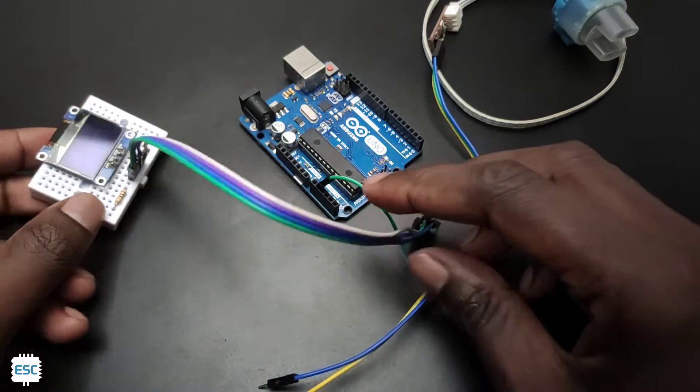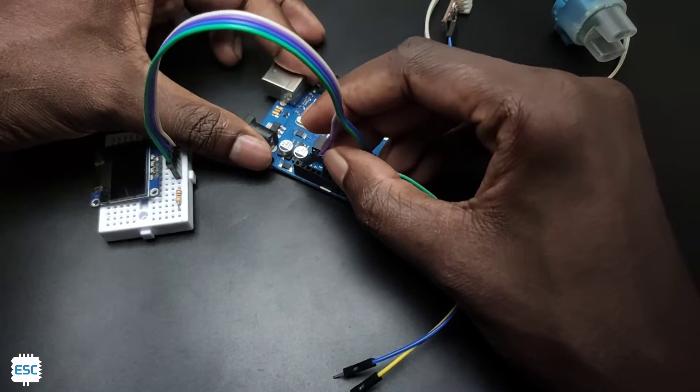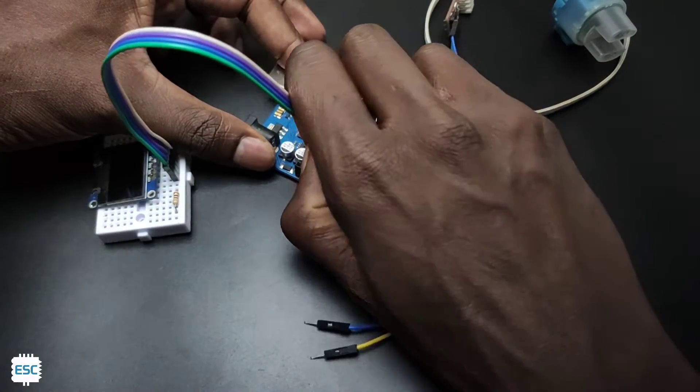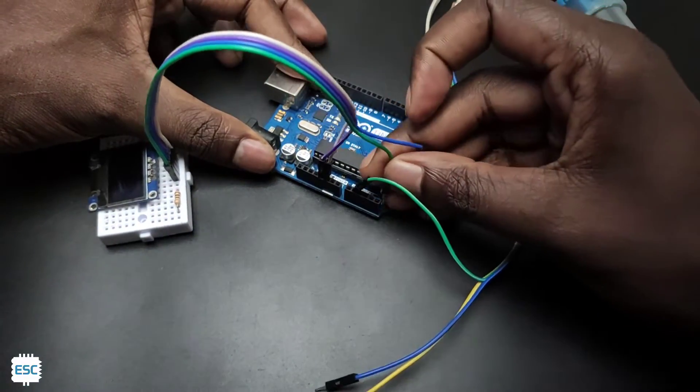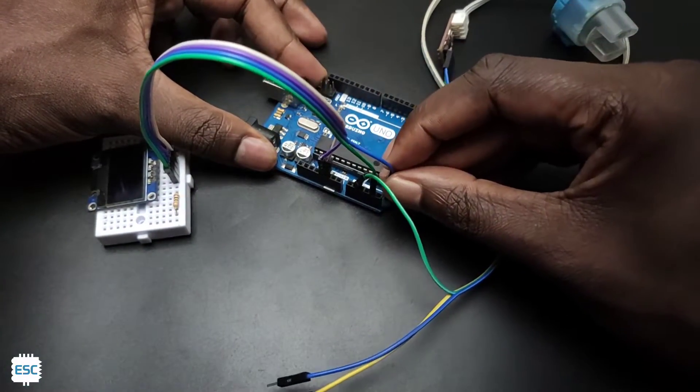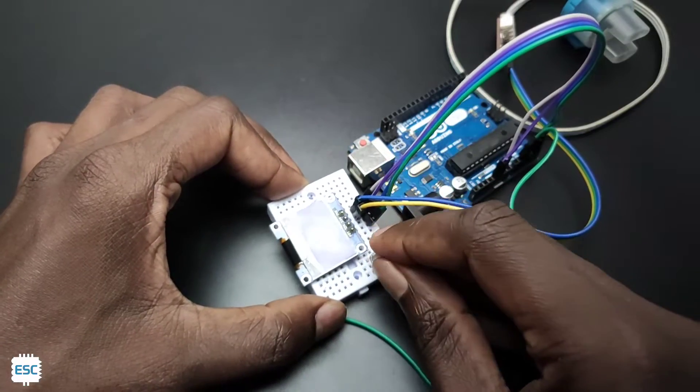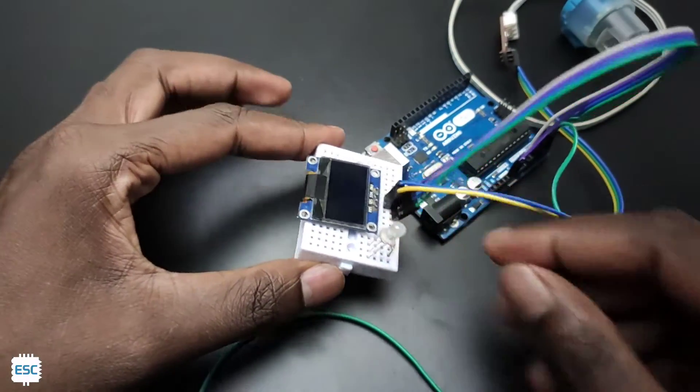Now let's build the turbidity meter. So I connected the OLED display to the Arduino. Ground to ground. VCC to 5V. SDA to A4. And SCL to A5. Also I connected a RGB LED.